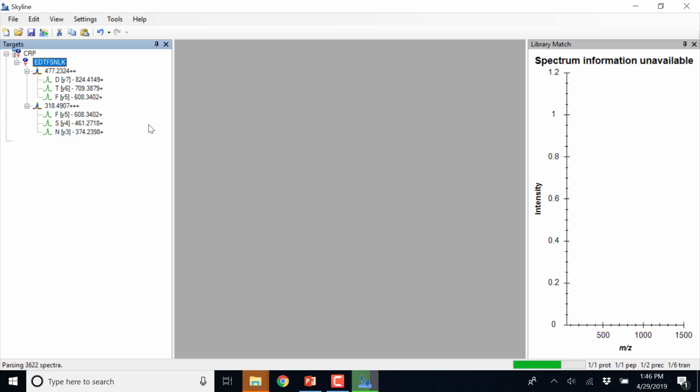Right, so usually when you look at a full mass spectrum from low to high mass to charge, there is a lot of additional peaks, what we call chemical noise or electronic noise that's present in the low mass to charge range. So we don't normally pick those because of the potential for noise interference, and also they're usually less selective for the peptides. So usually you can use settings in Skyline, bless you.